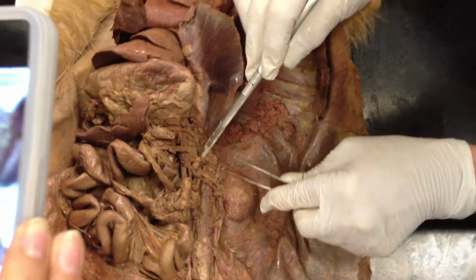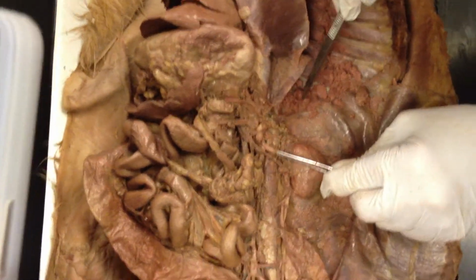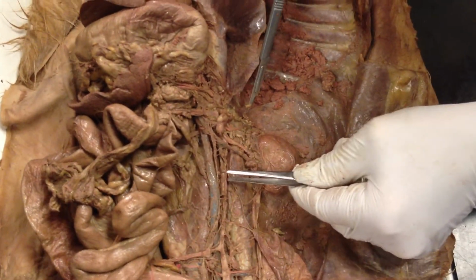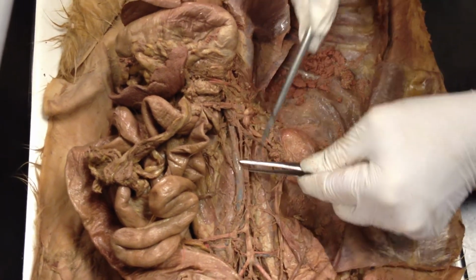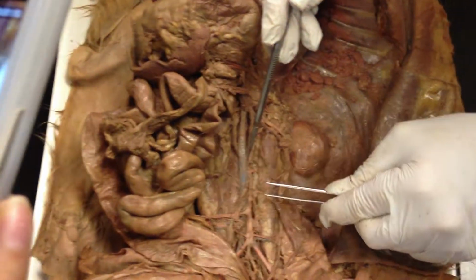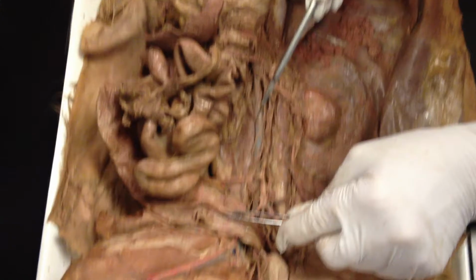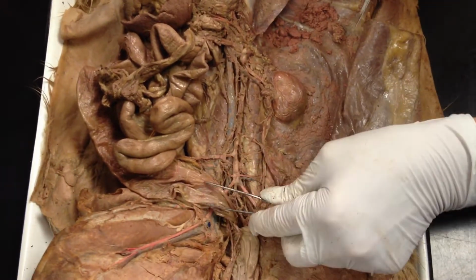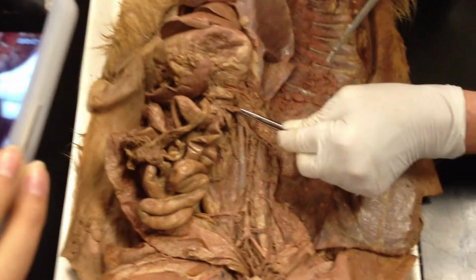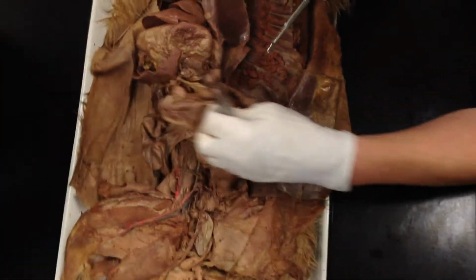Okay? Then we do adrenolumbar. You can see it on the dorsal body wall here. You'll see renal, and we'll talk more about renal next week. And then what we're going to have is abdominal aorta, and you will see the lumbars. There should be about 7 pairs of those. Once we get a little bit lower, you will see one that breaks off and goes by itself to the descending colon. This one right here is the counterpart to the superior mesenteric. It's the inferior mesenteric.